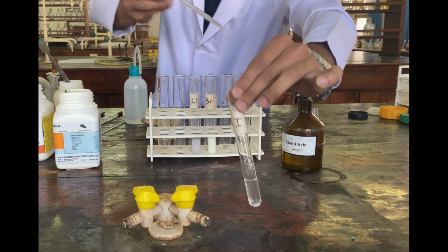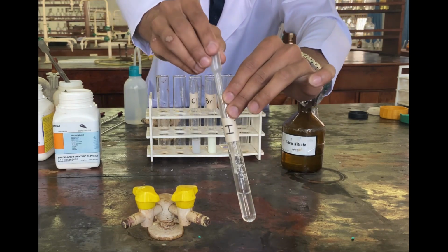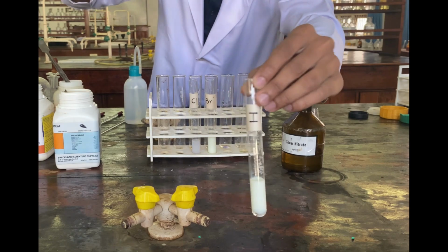When we add a little bit of silver nitrate to the third test tube, the color turns even darker yellowish. This is silver iodide.